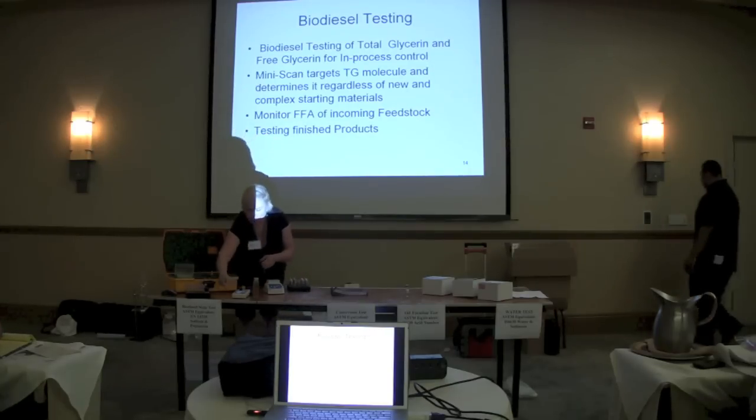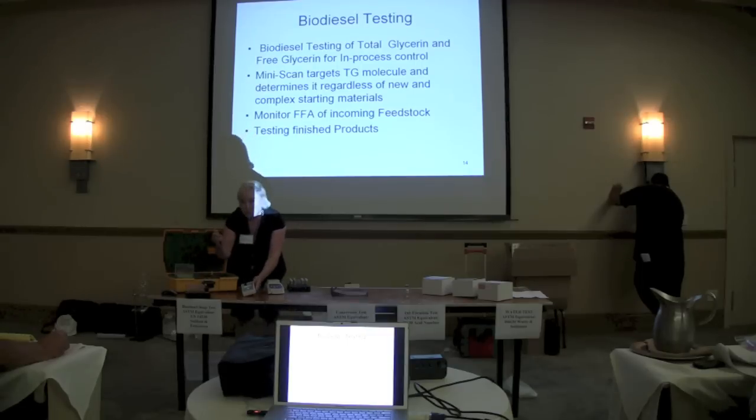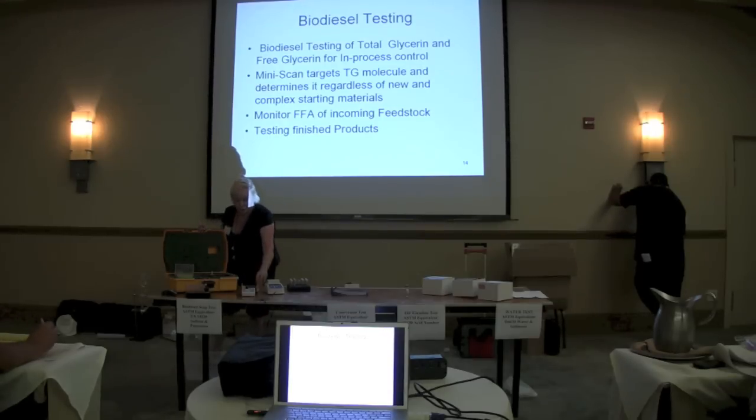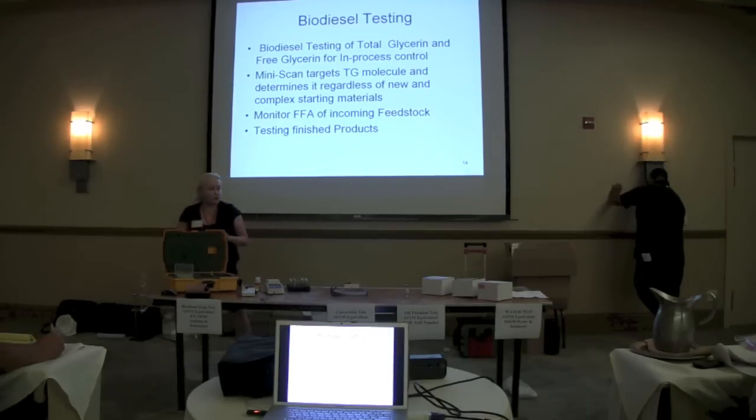So this would be the equivalent of what Graydon showed you to do the free fatty acid titration. I'm going to shake that up, and I'm going to be able to read it. That's my sample. I select on here free fatty acid test. Normally I would just simply put in the tube and make a reading. It would display the free fatty acid results, and it would also have them stored on the flash drive on the unit. So that's a free fatty acid equivalent titration.